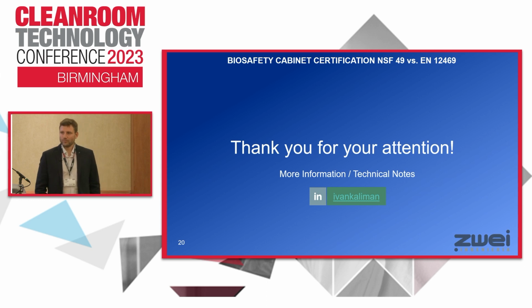AS 1807. Yeah. So Australian standards are also considered. South Africa adopts EN 12469 into the SANAS standards. So internationally, there are differences in biosafety cabinet standards for testing.